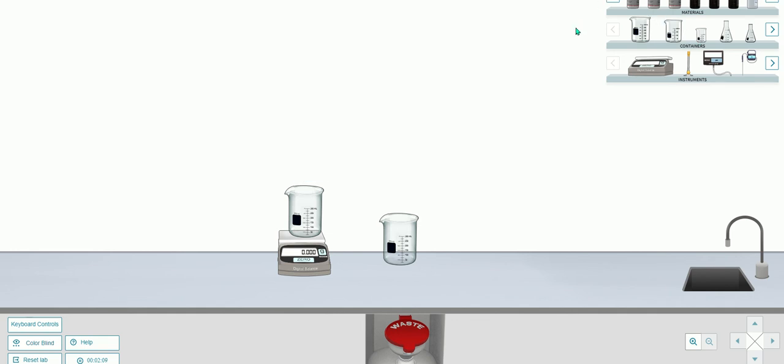As I mentioned previously in lab 1 video, you'll get the hang of it. After a while, this just gets repetitive, like me showing you. In future labs, I will be showing you how to use different instruments such as the Bunsen burner and the pressure gauge, because you haven't just yet for the Bunsen burner and pressure gauge. I believe you use the thermometer in lab 1, so you'll probably be fine on that one. And that's pretty much it for measuring.